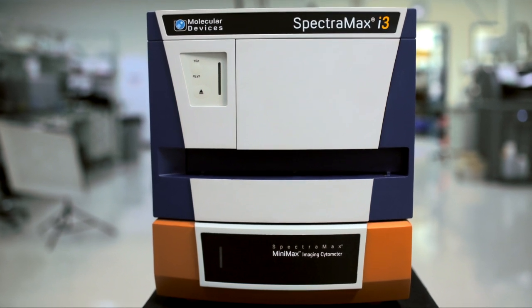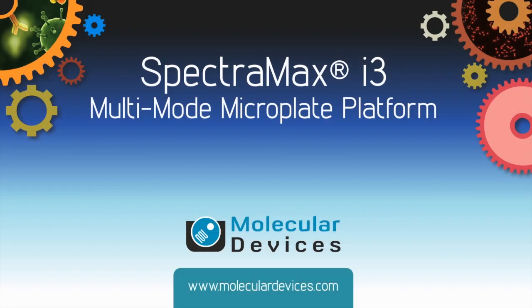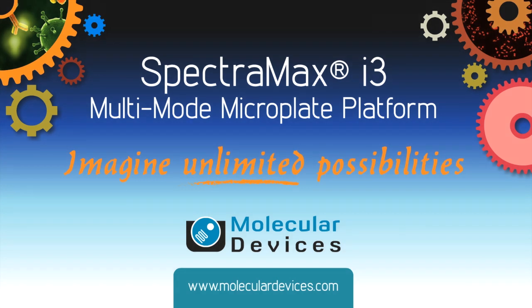Imagine the SpectraMax i3 platform in your lab today and begin to realize just what this system will bring to your research.